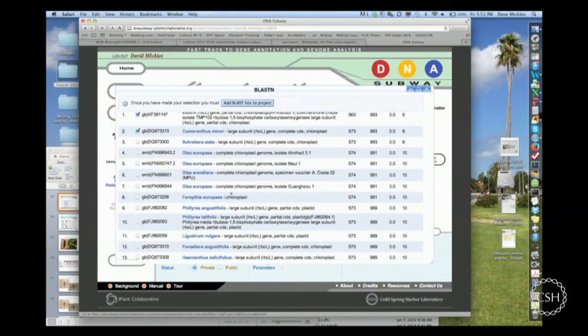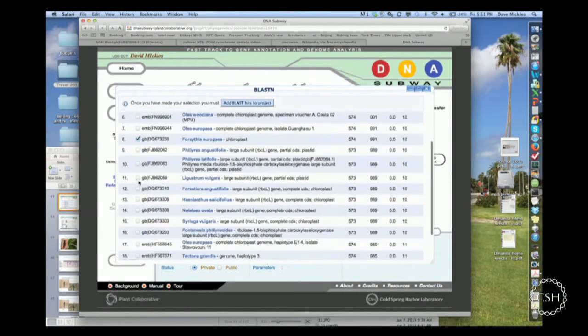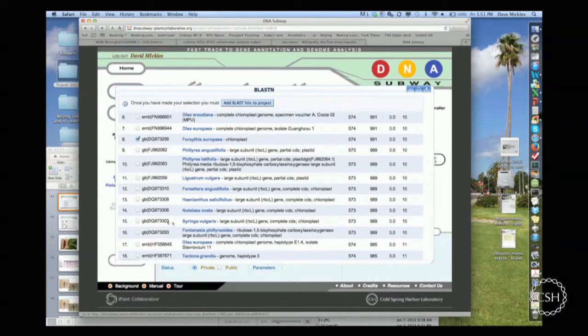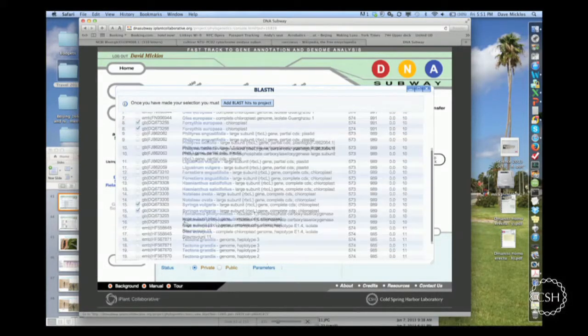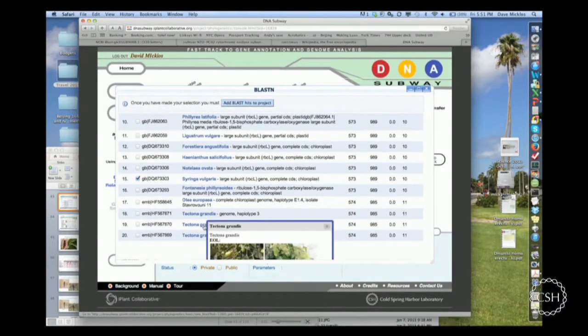But here's something that I recognize, some relatively closely related things that are in the oleander or olive family. So I'm not that great on plant taxonomy, but normally you can figure something out. Here's one that we know, Forsythia. So this is a plant that has some relationship to some of these things. This is that sweet-smelling thing, lilac, Syringa. And this is actually an interesting one here. I can't quite remember what it is. I think it's a redwood.